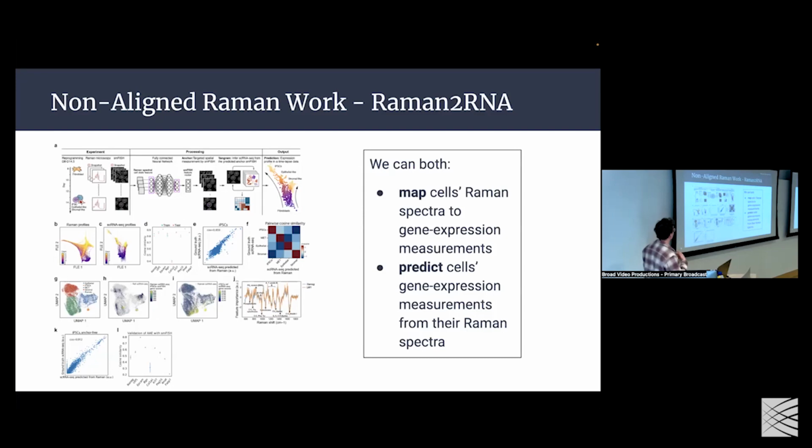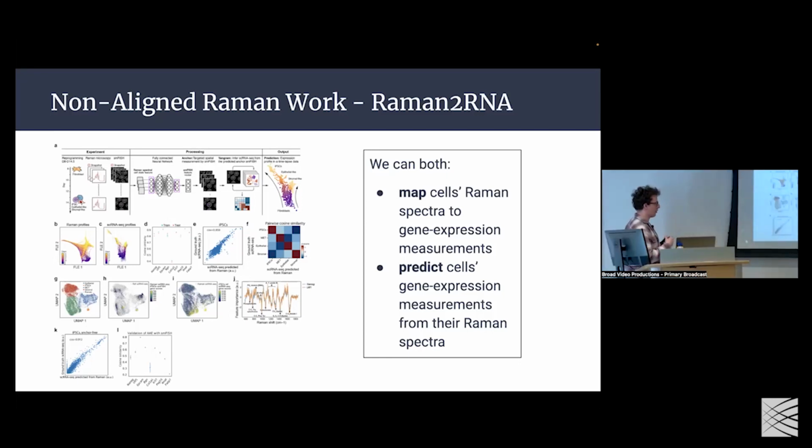I'm not going to dwell too much on this, A, because I'm not the corresponding author, and B, we'd be here another few hours. But more or less, we provide a method for mapping Raman spectra onto existing single cell gene expression data. If you have a sample of Raman spectra data and a sample of transcriptomic data, we can map one cell from one data set onto the other. We can also predict using deep learning. Using a similar method as in SHAF, this adversarial autoencoder common latent space setup, we can translate from Raman spectra to gene expression profiles.